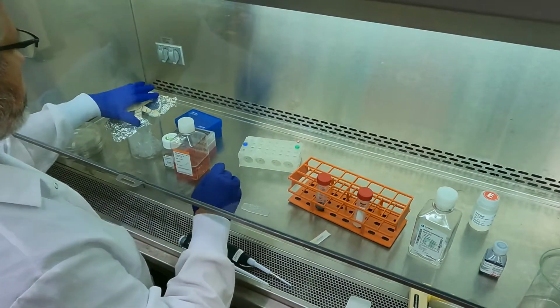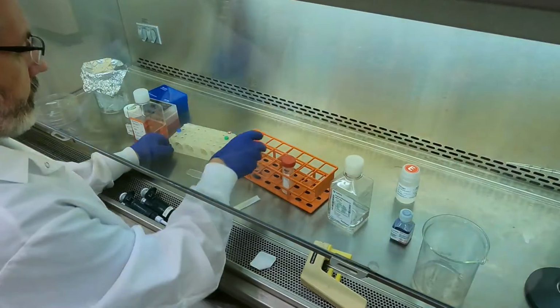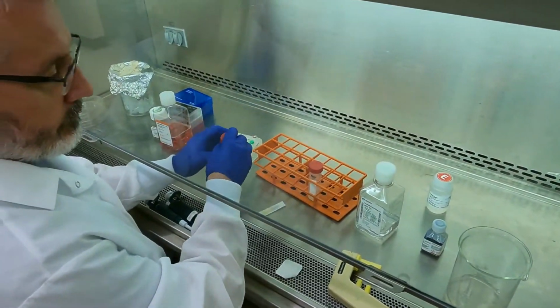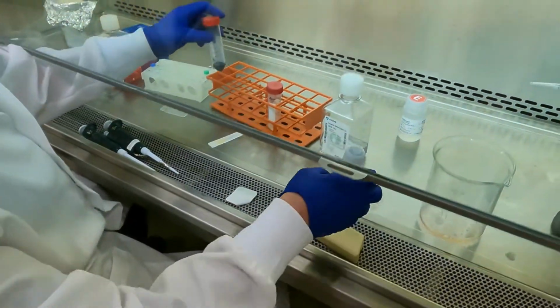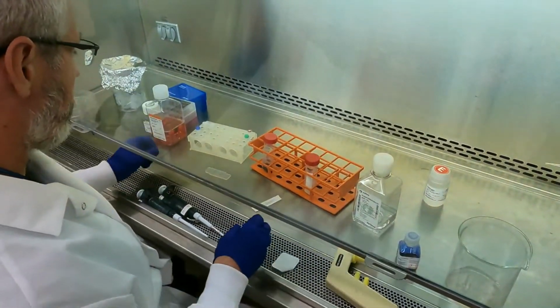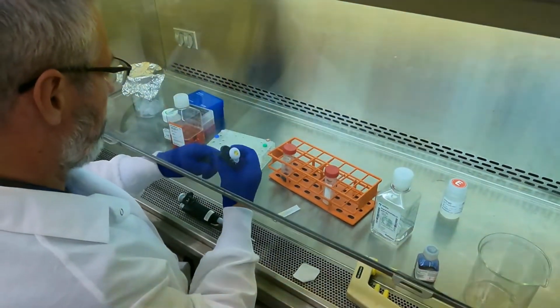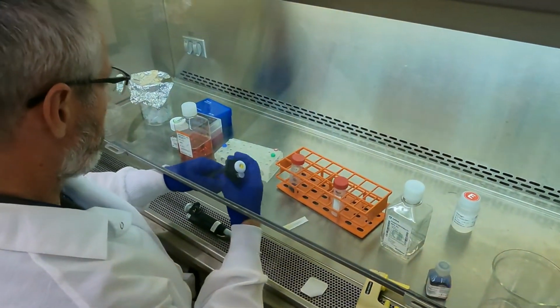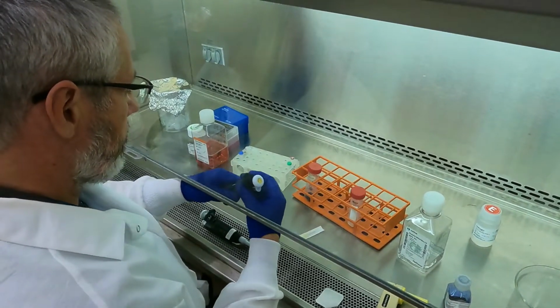I'll re-autoclave these in a second. Right, so this is filtered trypan blue, and I always filter it because for some reason I get bits in it, and that can interfere with the counting. And so I want 100 microliters of cells to count.